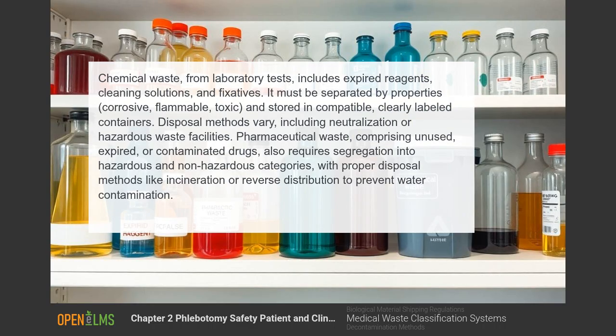Chemical waste from laboratory tests includes expired reagents, cleaning solutions, and fixatives. It must be separated by properties, corrosive, flammable, toxic, and stored in compatible, clearly labelled containers. Disposal methods vary, including neutralization or hazardous waste facilities. Pharmaceutical waste comprising unused, expired, or contaminated drugs.